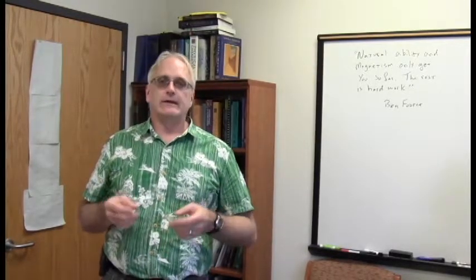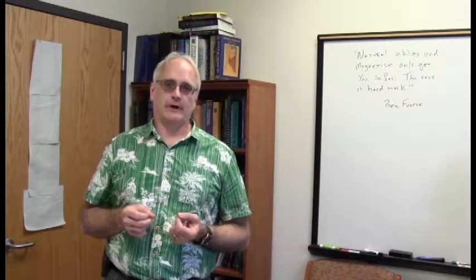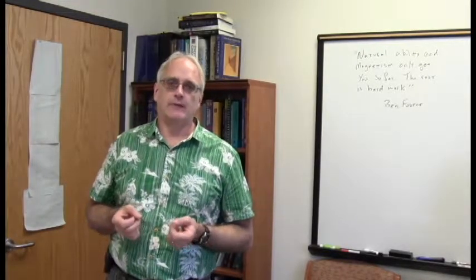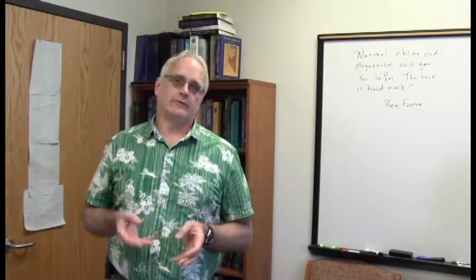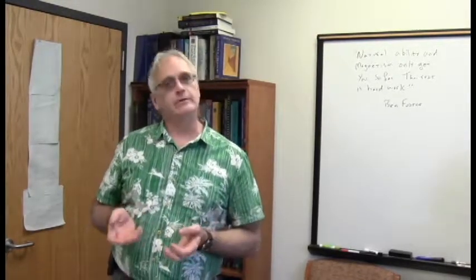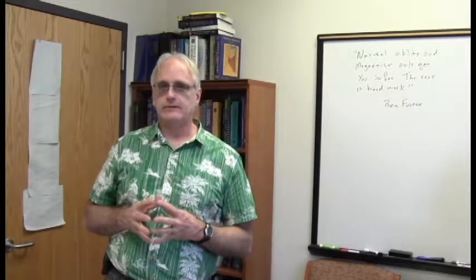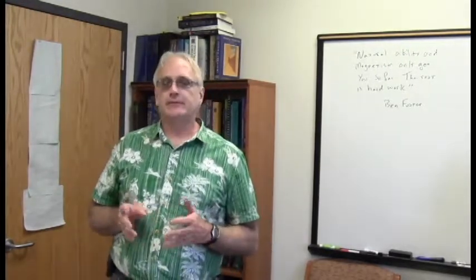And so back in the 50s and 60s, there was a recognized strong need to standardize NMR spectra. And that led to a search for a chemical compound that we could all agree would be the standard. And so the search was on for a reference standard to be used in NMR spectroscopy. And it was decided whatever you chose had to meet a number of different criteria.